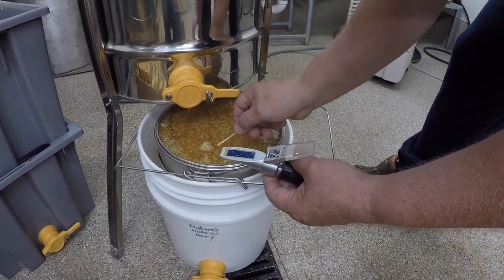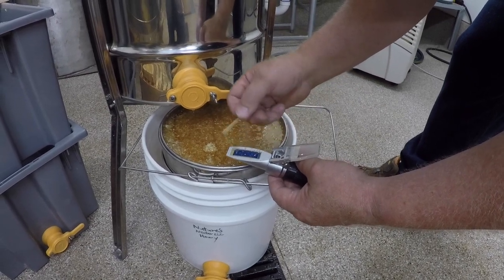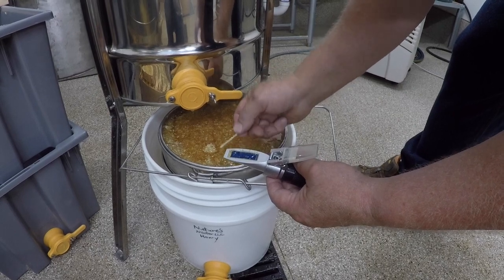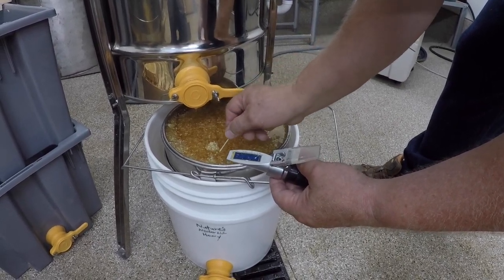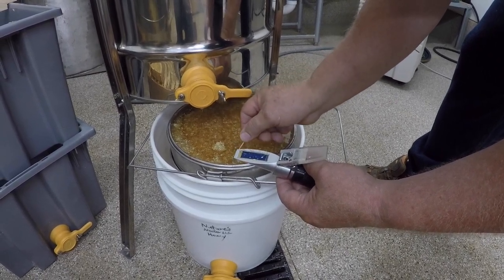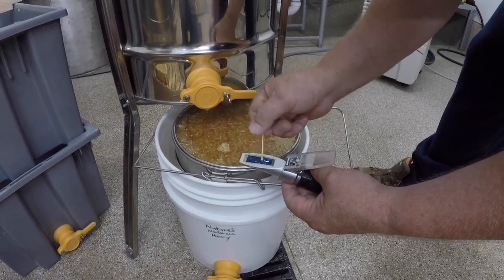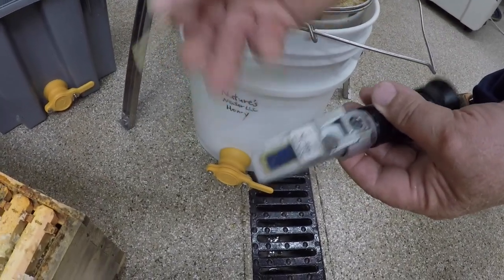I don't need very much, but if you bring it in a jar, it could be a small jar, you want to have it full, because if you put a little sample in a quart jar, it'll absorb all the air. Any moisture that is in that jar will go into the honey. So you always want to fill up the container, then it won't absorb any air and give you a false reading. So that's covered, and then I just put that down.